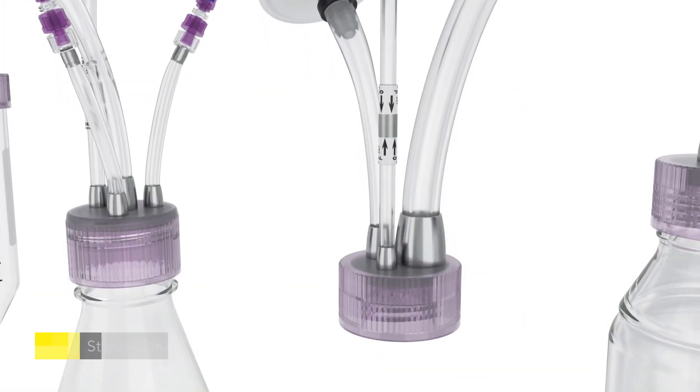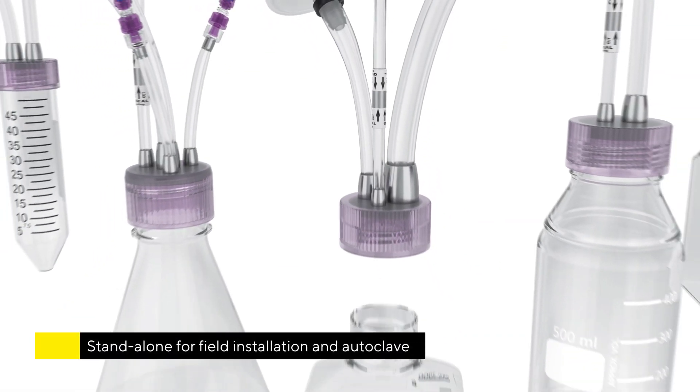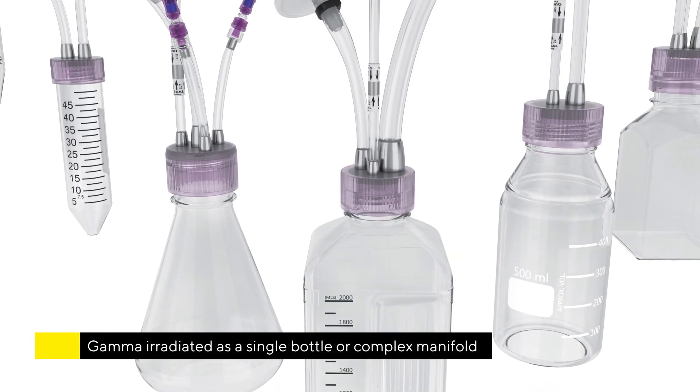Purchase your MyCap stand-alone for field installation and autoclave, or gamma irradiated as a single bottle or complex manifold.